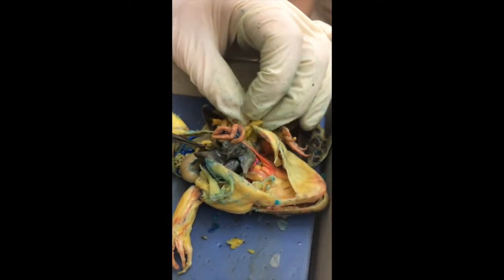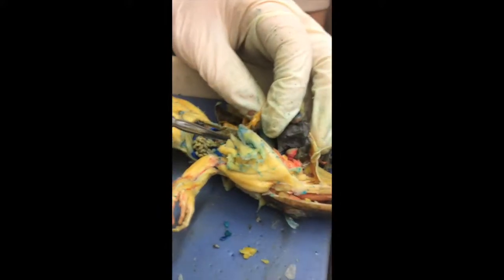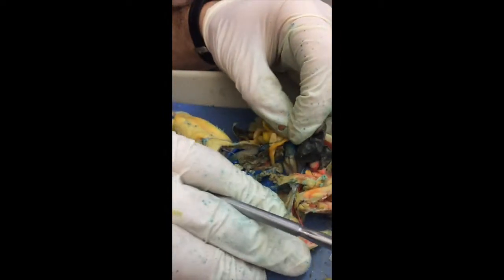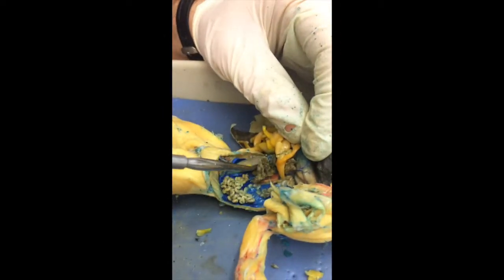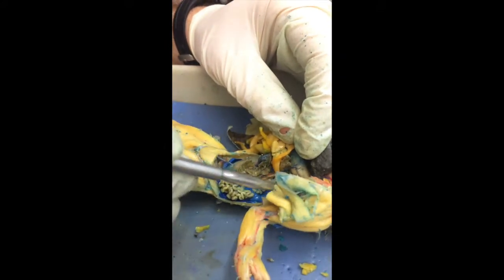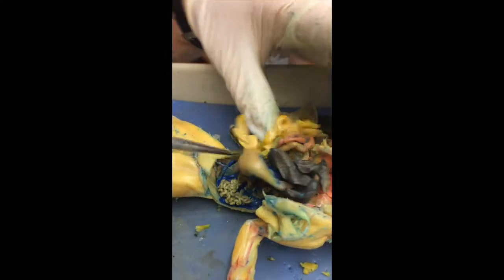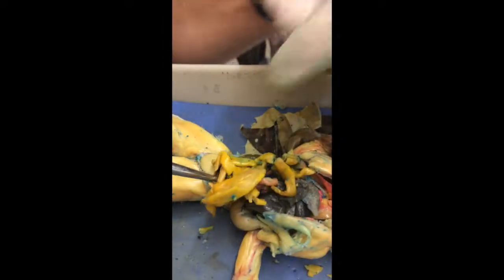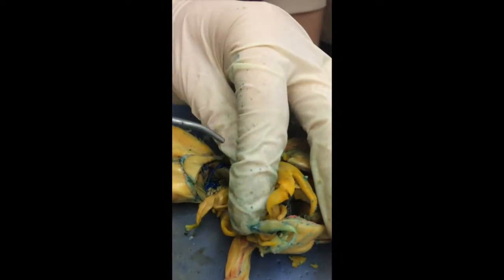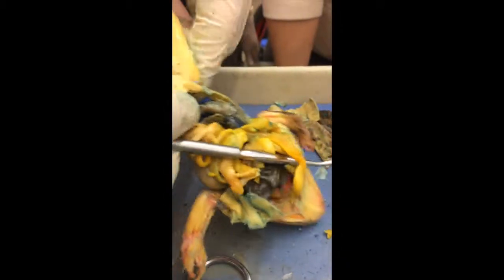This is a female frog. These are ovaries, the spotted things. This is oviduct. This is the rectum, and it's going into the one opening, the cloaca.